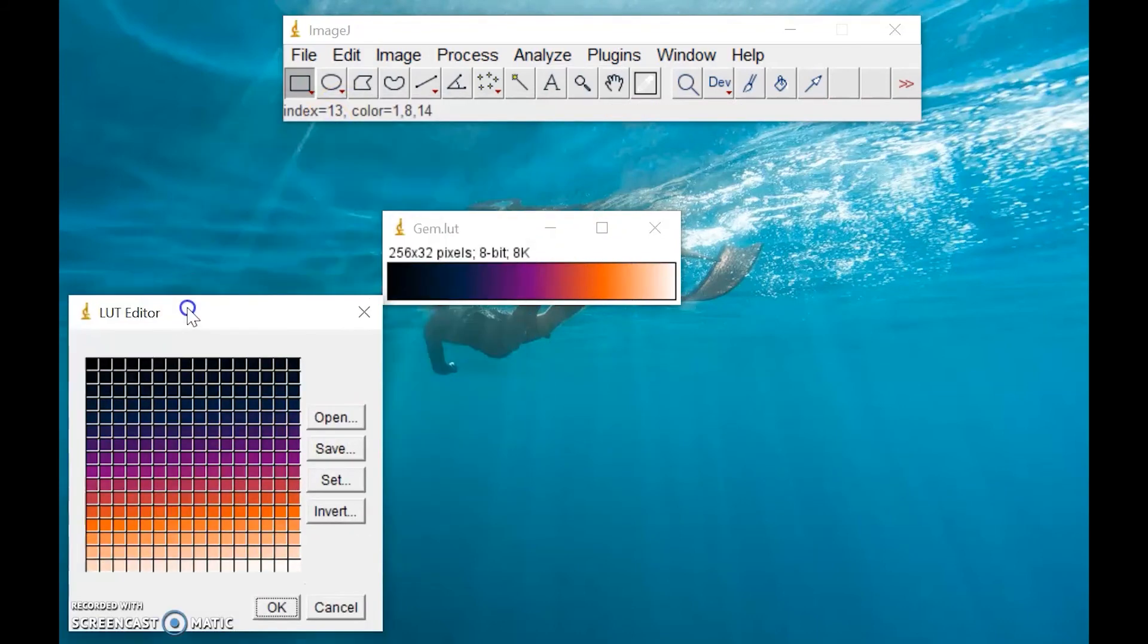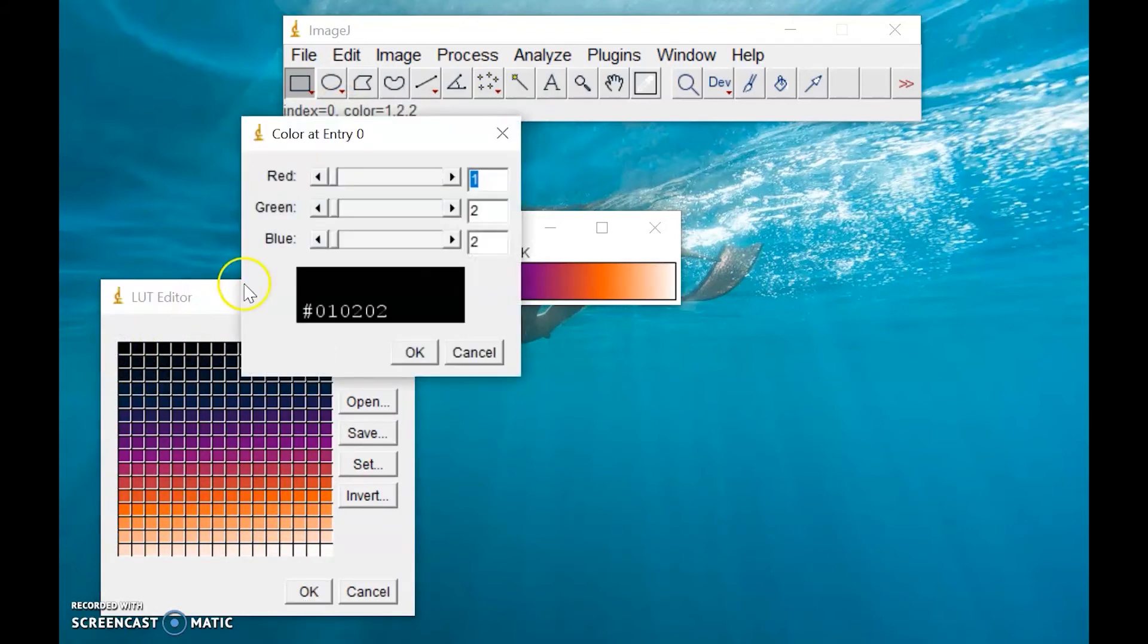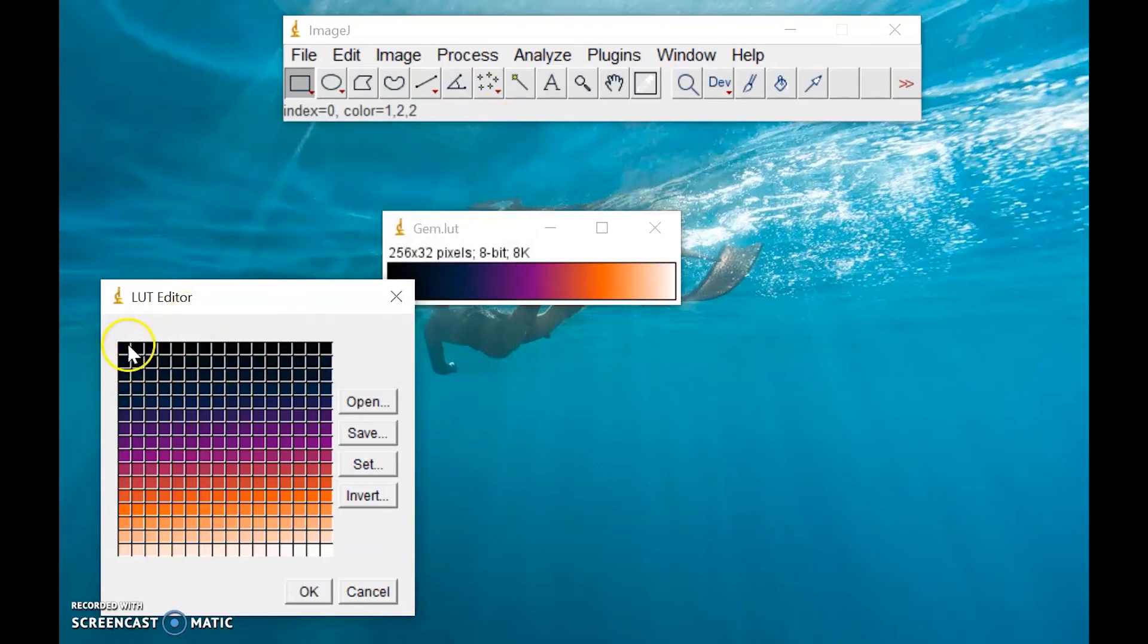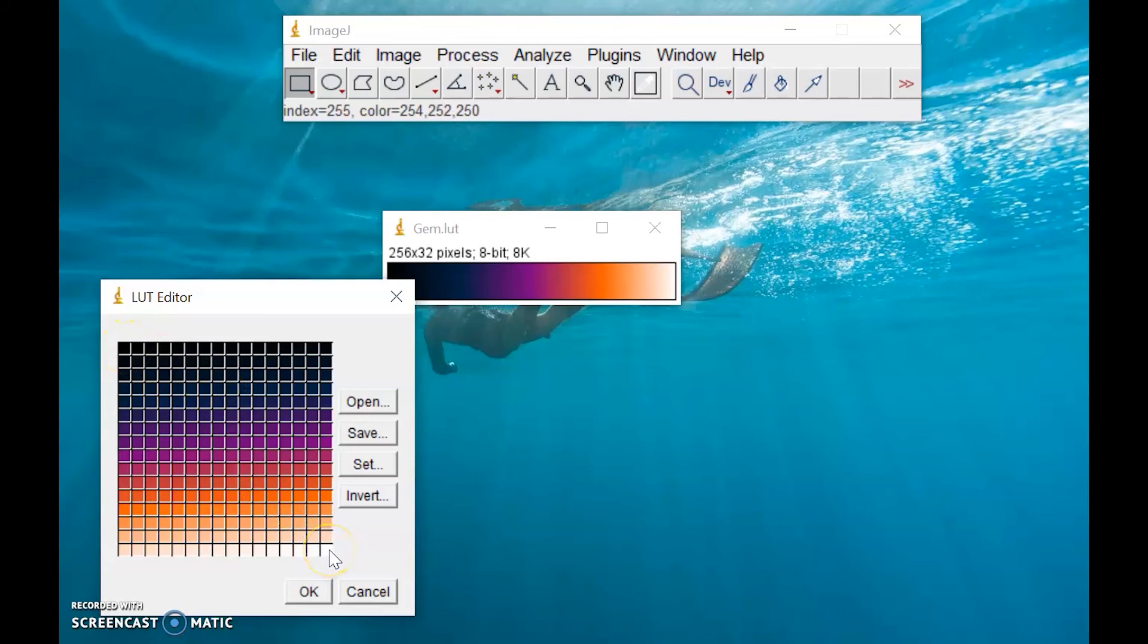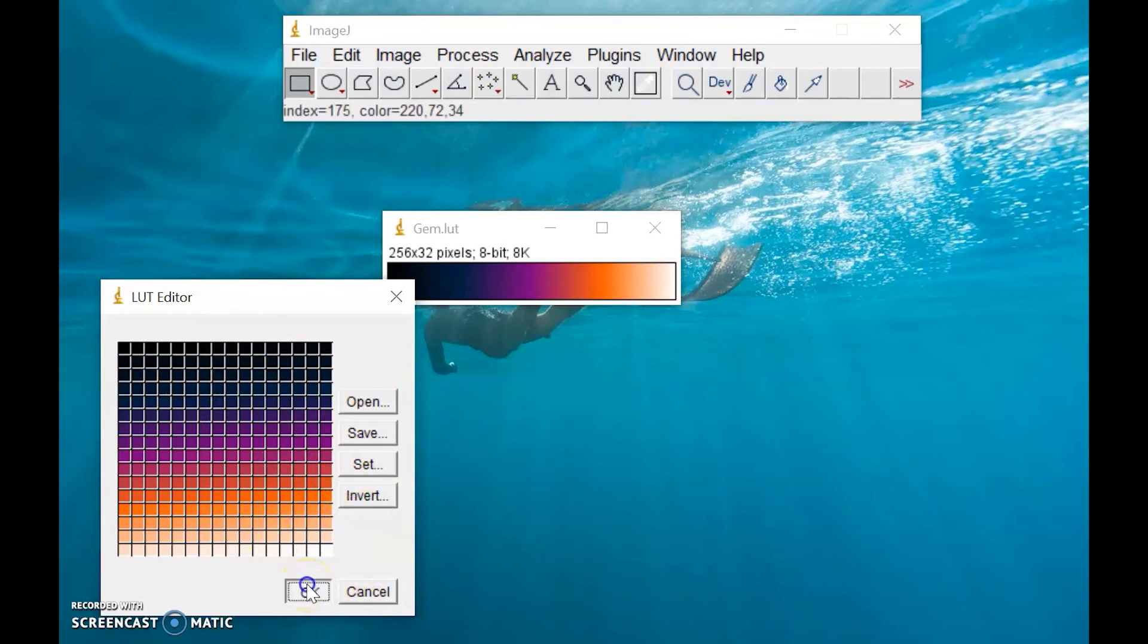For this case, we can edit this gem lookup table. This part here refers to the zero pixel or to the zero pixel intensity, while this one refers to 255 pixel value. You can create your own lookup table using this option.